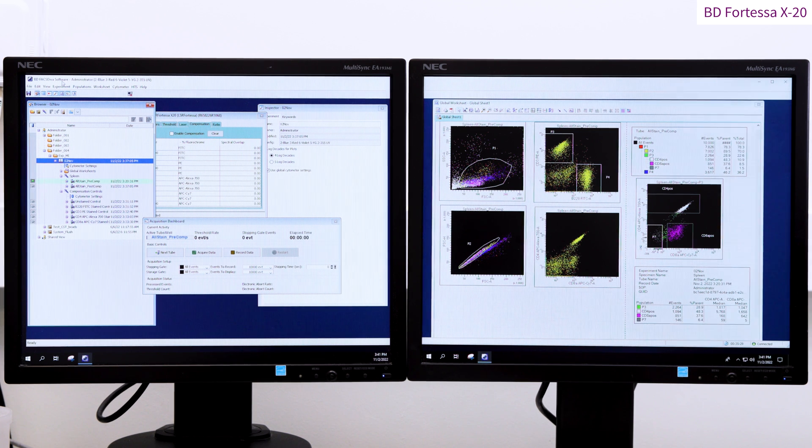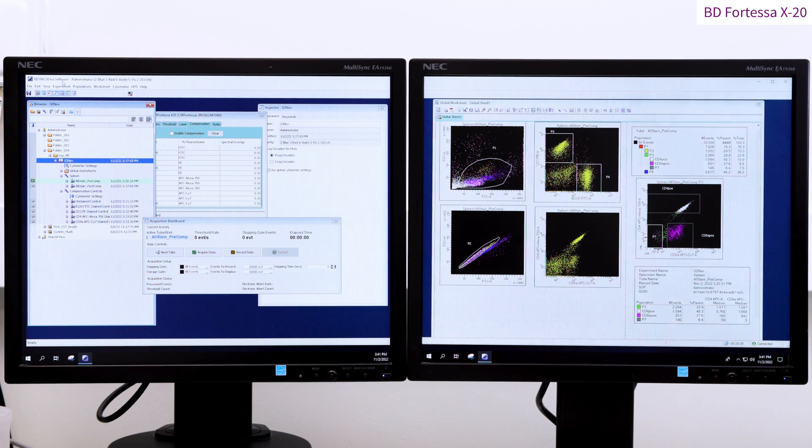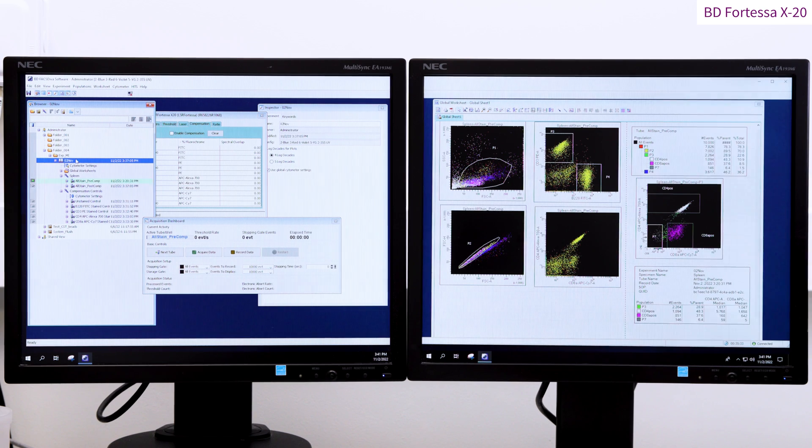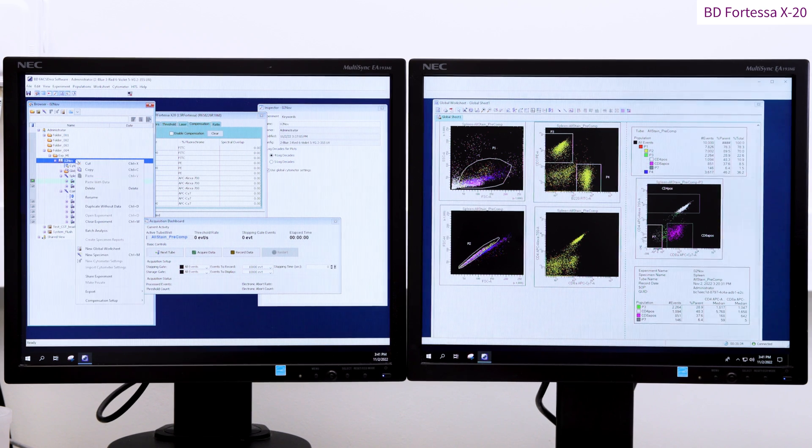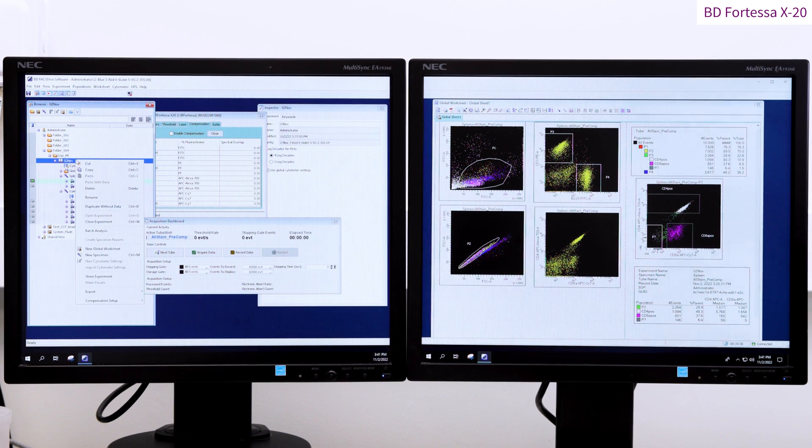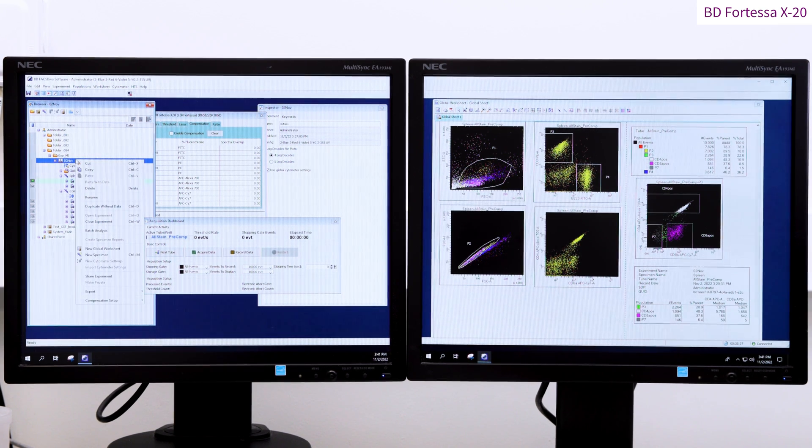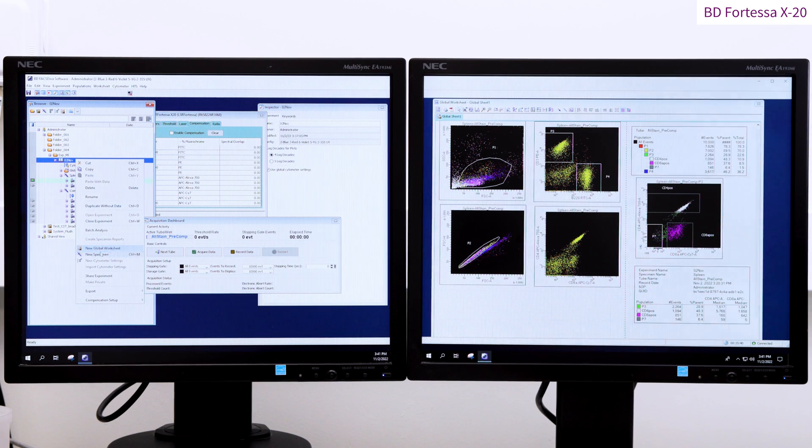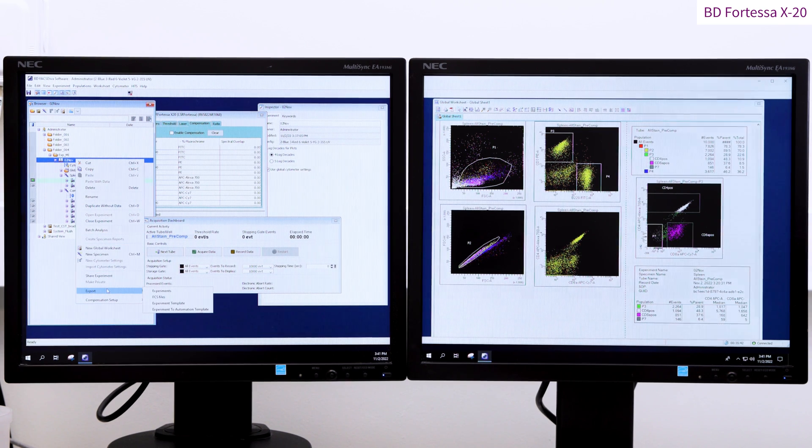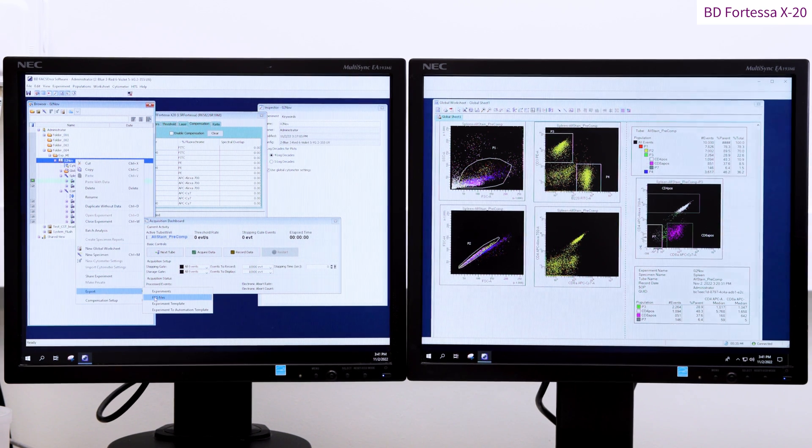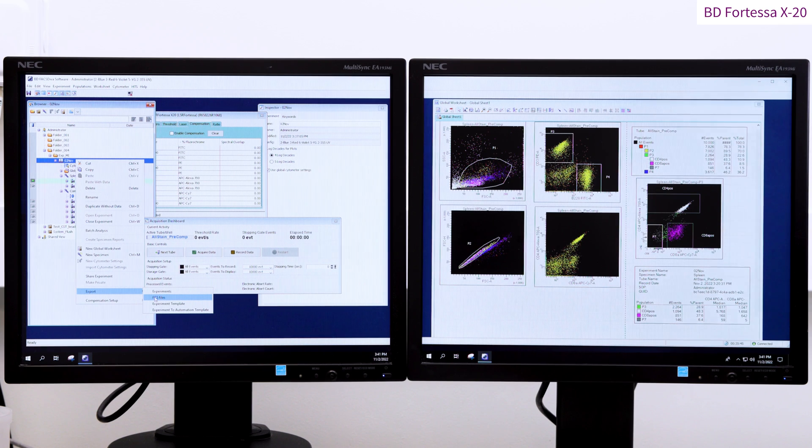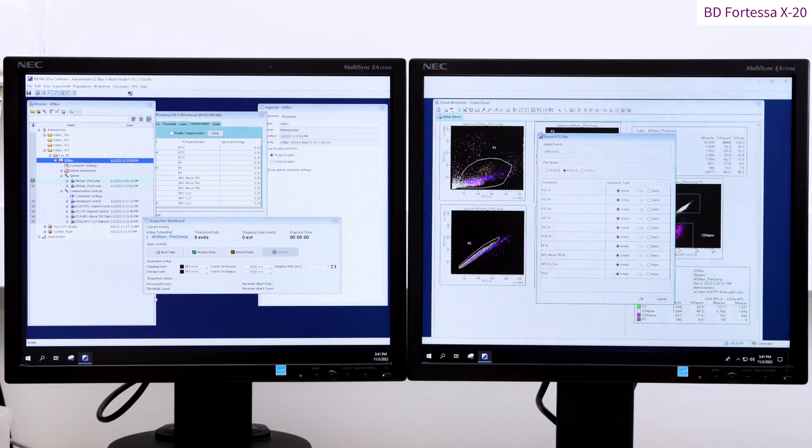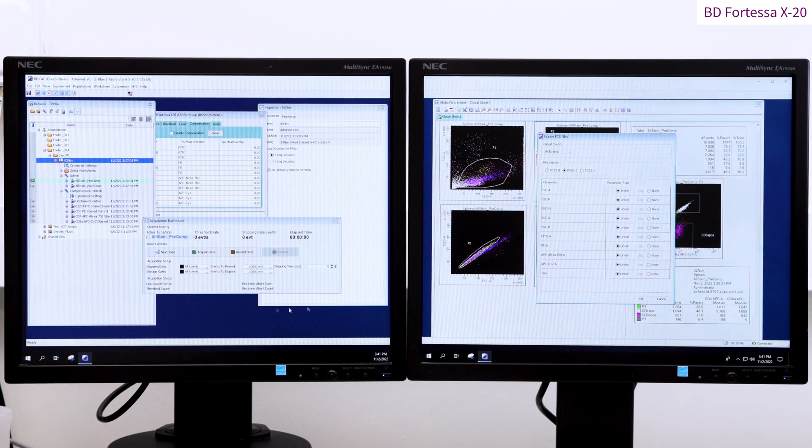It is a good idea to back up your data and experiment templates frequently and transfer those backups in line with your institutional data management policy. Right click on the experiment folder to export your data as FCS files, preferably the latest version which is here 3.1.